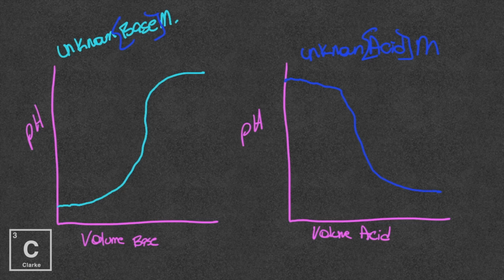Now these graphs are a little bit sketchy because I'm freehanding them, and you know how my freehand drawing is. But if you were to Google these, they're going to look pretty much just like this. Again, if you're looking at a strong acid, strong base. Okay, now the whole point of looking at this graph is to find the equivalence point. The equivalence point is going to be where it starts to very quickly incline. That should line up when the pH is 7.